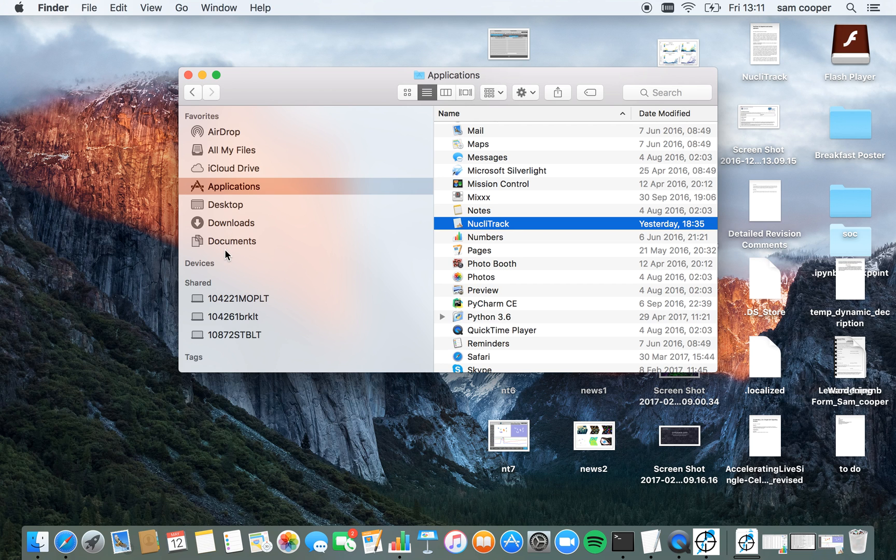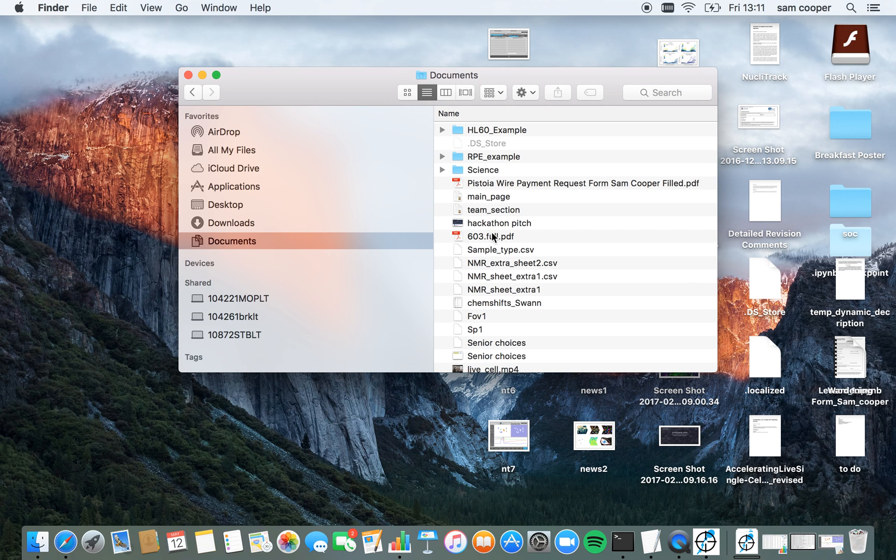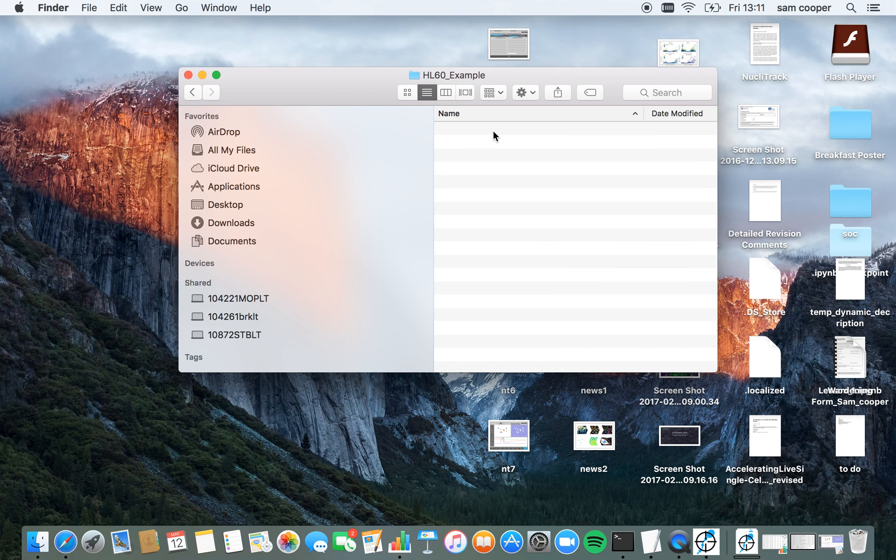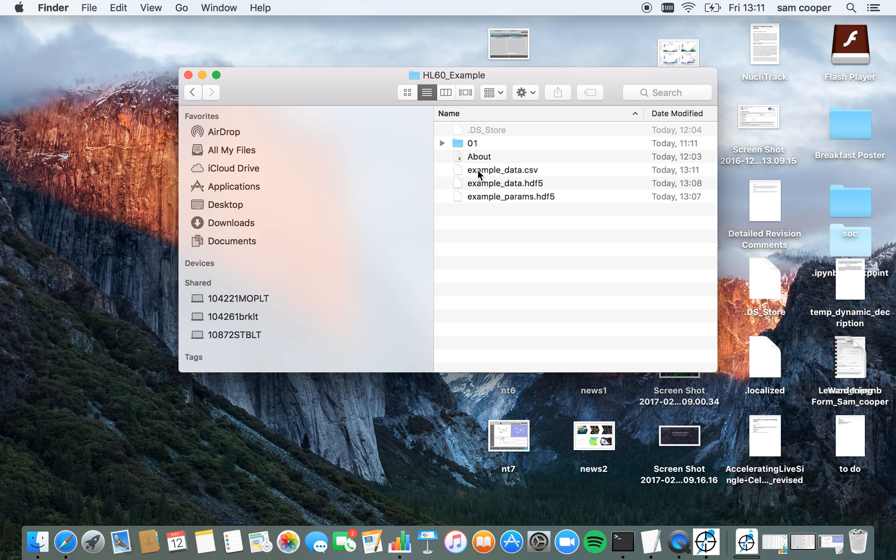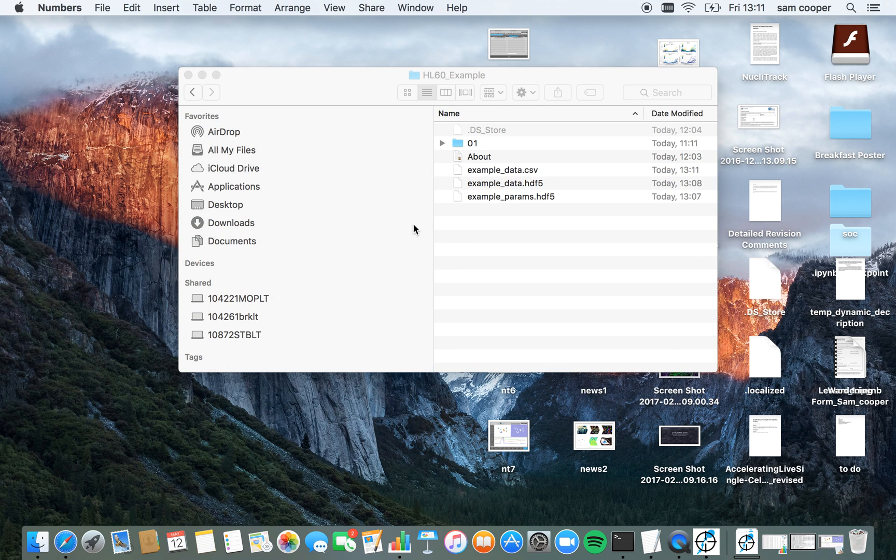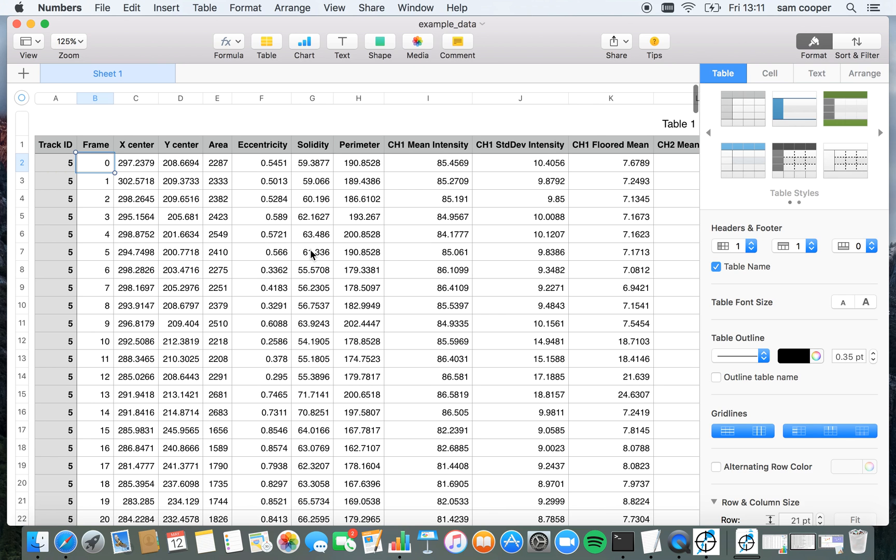So I go to documents, HL60 example. And you can now see example data dot CSV has been saved here. If I open this with numbers, we will see all of the tracking data from this video.